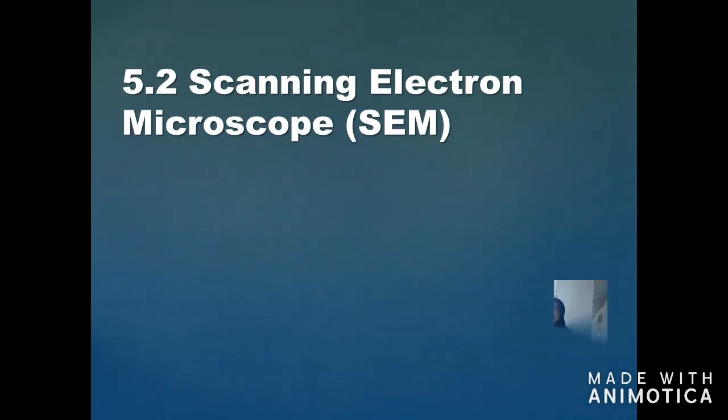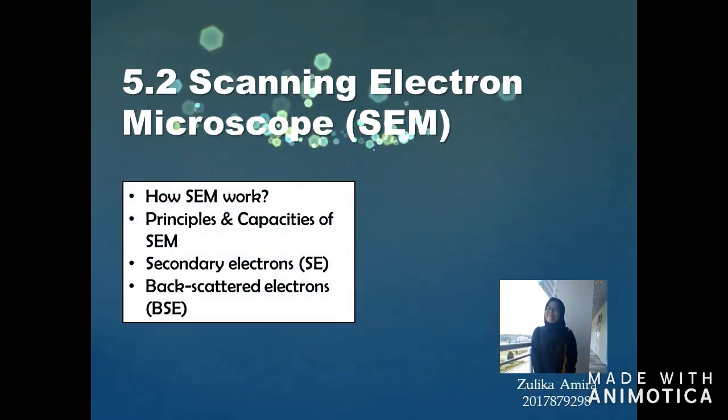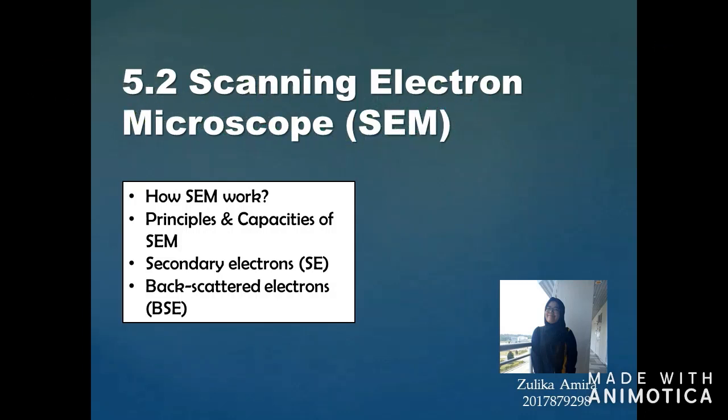For the 5.2 subtopic, which is scanning electron microscope, we will cover how the scanning electron microscope works, the principle and capacity of the scanning electron microscope, secondary electrons and backscattered electrons.